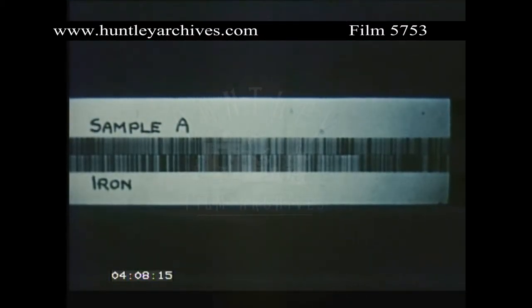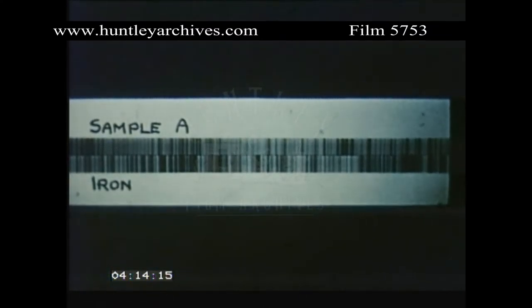Often, a standard element such as copper or iron with known wavelengths is recorded alongside an unknown substance, to act as a kind of reference or measuring tape.